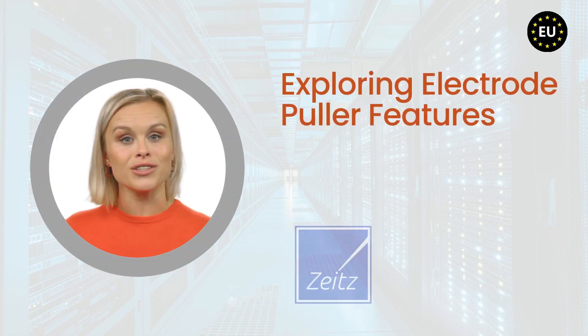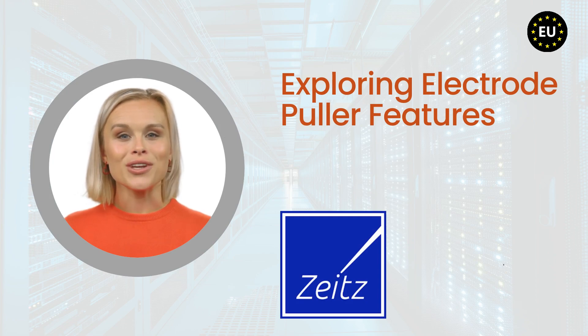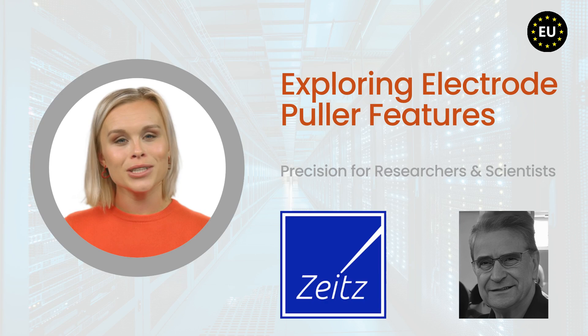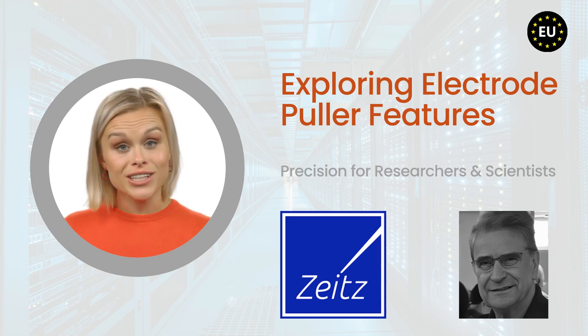Welcome to our video exploring advanced features of our electrode puller, made in Germany. This DMZ puller is designed for precision and reliability, making it ideal for researchers and scientists in universities and biotechnology fields, developed by Werner Zeitz at the Technical University of Munich.